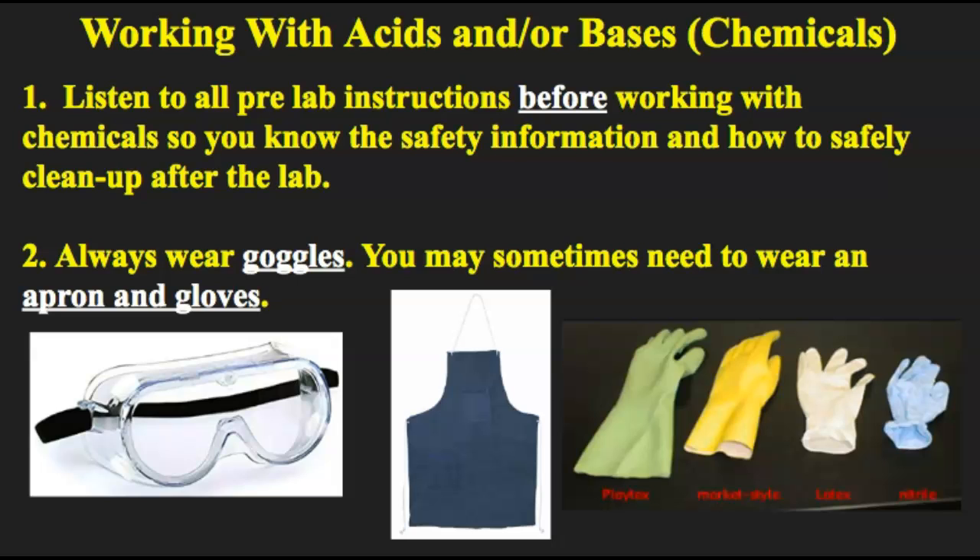Whenever you're working with chemicals you should be wearing goggles. There's a continuum of how hazardous chemicals are to your body and you should always be aware of that. Anything that's hazardous to your body you'll be required to use goggles. Sometimes you may need to wear an apron and gloves. I have a picture — these are indirect vent chemical resistant impact goggles. They have little vents on each area and remember to make sure those vents are closed at all times to protect your eyes.